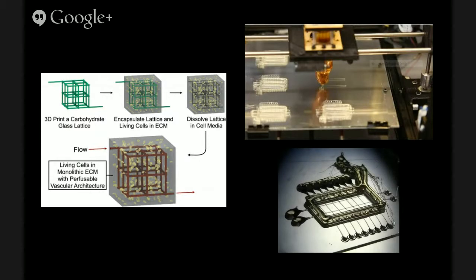One of the approaches that Jordan Miller took is he got together with some people from the hacker community in Philly and devised this special extruder for the printer. I think he was actually eating dessert one day, some kind of fancy dessert with this sugary decoration on top, and he's like, "Oh, this is what I need to make a vascular system that I can dissolve and wash out." So he set about figuring out how to make this.